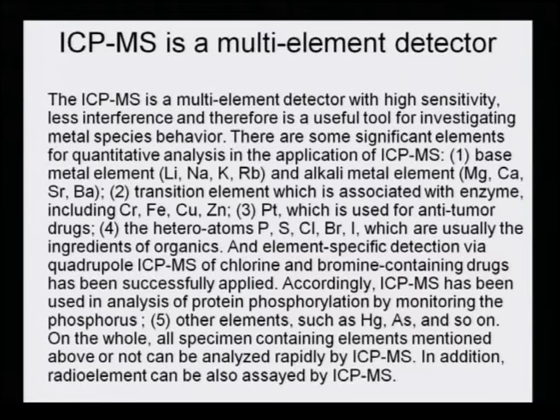So, you see there is a great versatility for every type of sample, from every sphere of life, whatever the sample type: pharmaceutical sample, biological sample, forensic sample, environmental sample, ceramic sample, alloy sample, all can be detected by ICP-MS very efficiently and precisely.